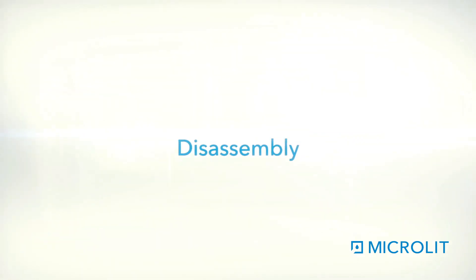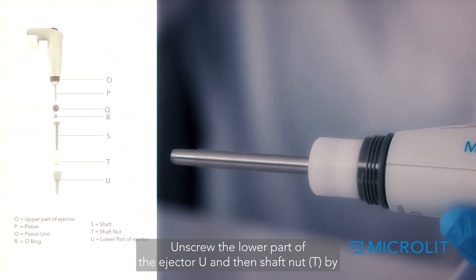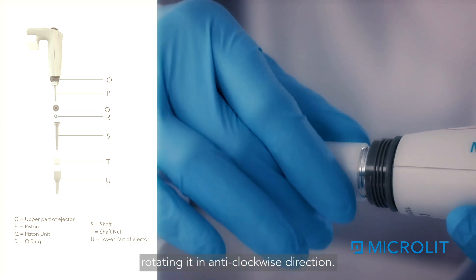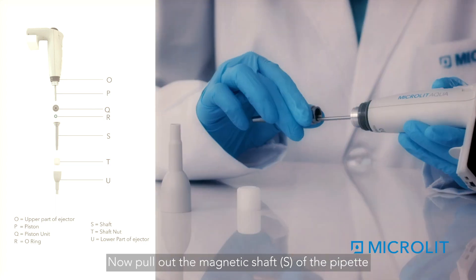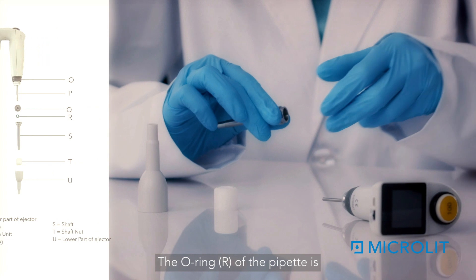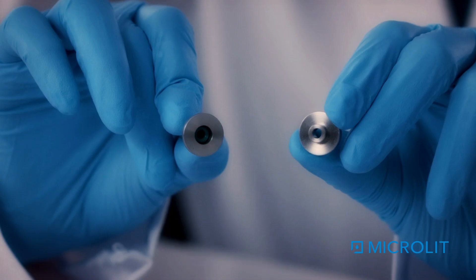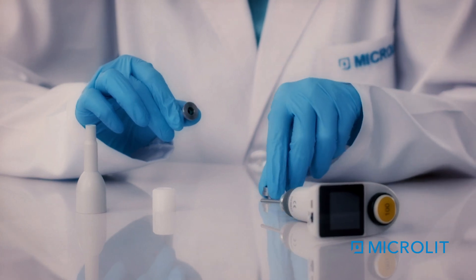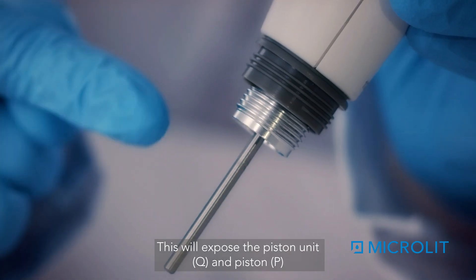Disassembly: Unscrew the lower part of the ejector and then the shaft nut by rotating it in an anti-clockwise direction. Now pull out the magnetic shaft S of the pipette. The O-ring R of the pipette is inside the shaft S — change the O-ring only if required. This will expose the piston unit Q and piston P.